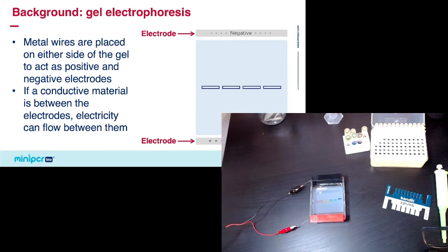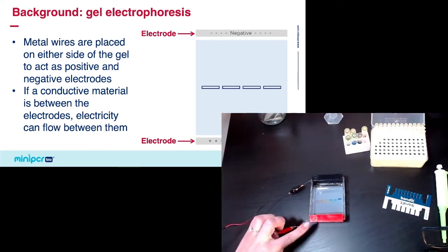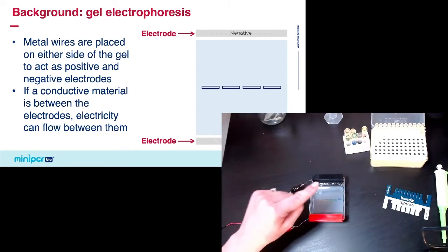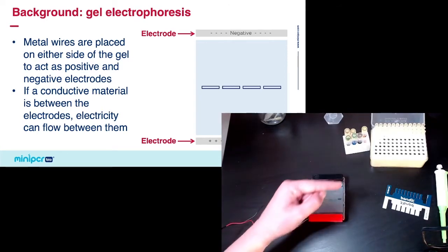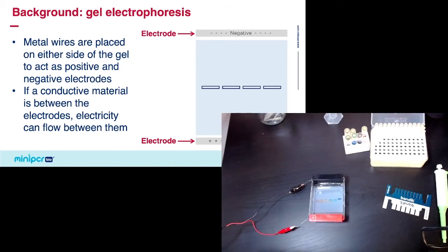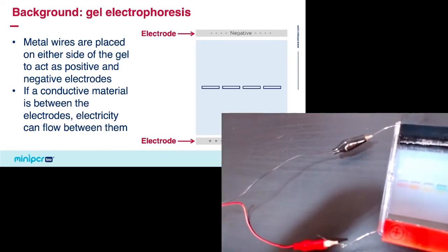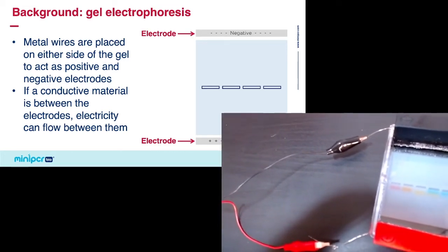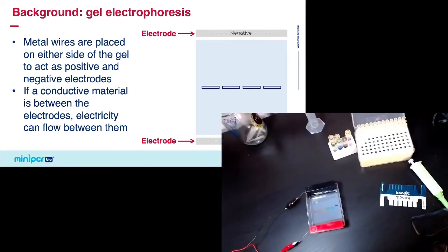The other thing that I want to point out, again, is that we have electrodes on either side. And so again, the top here is our negative electrode, and the bottom here is our positive electrode. And you might be able to see that with this little positive symbol down here. In an electrophoresis setup, you have metal wires placed on either side of that gel that act as these two electrodes. And then you have a conductive material between them. So we have this running buffer that I added right at the beginning, and that's going to allow electricity to flow between these two electrodes. And again, I'm going to zoom you in just a little bit here with the camera. You can see these two wires coming off of the sides that are connected to our electrodes. And that's really all that this is. This is plugged into a USB power source, and we just have a positive side and a negative side. And that is going to create the electric field that allows our samples to run through the gel.